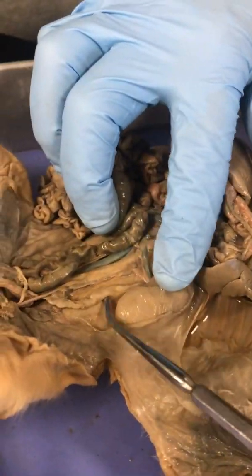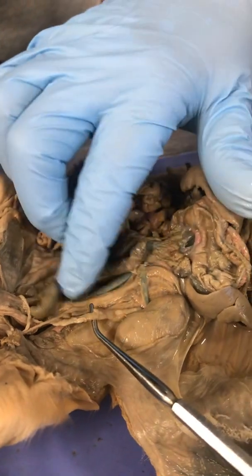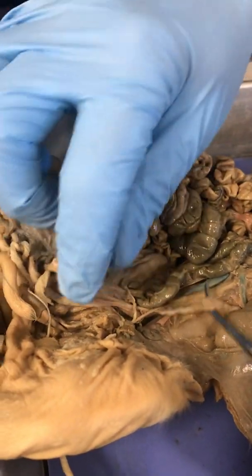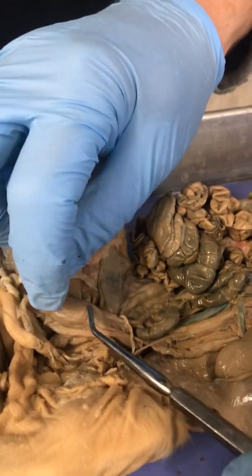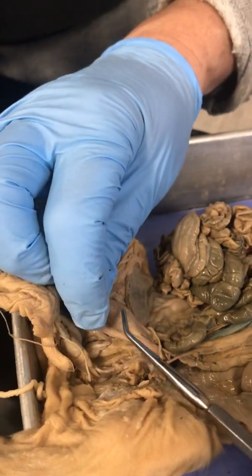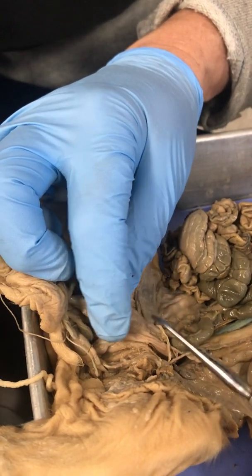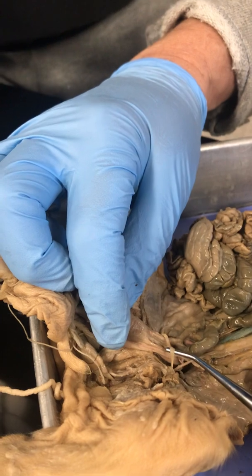What is this tube coming off the kidneys? The ureter. And if you look at where it's going, if you give it a pull, you can see it going right up into this structure. So we know this is the urinary bladder, right? This is a male, so coming on the posterior side of the urinary bladder, the vas deferens.